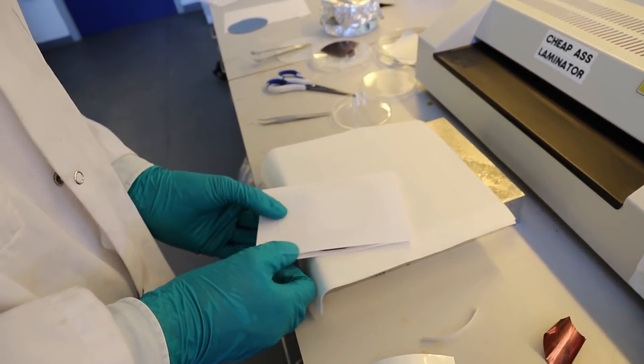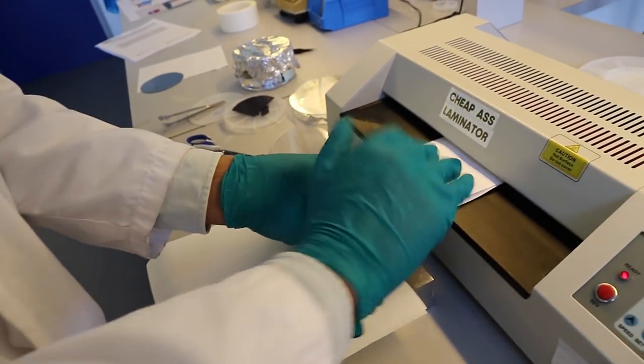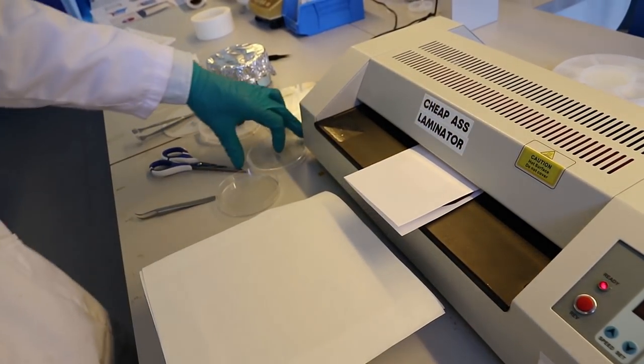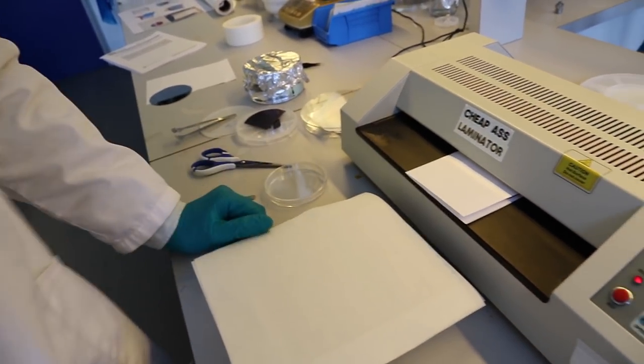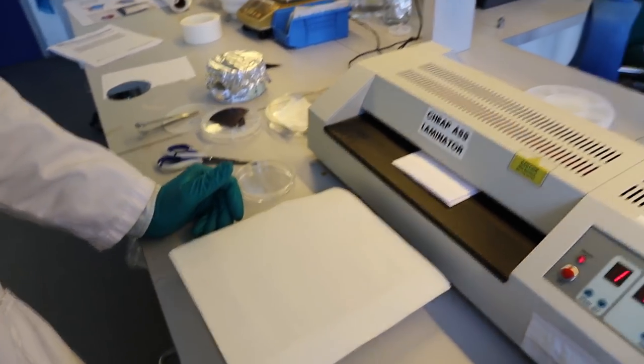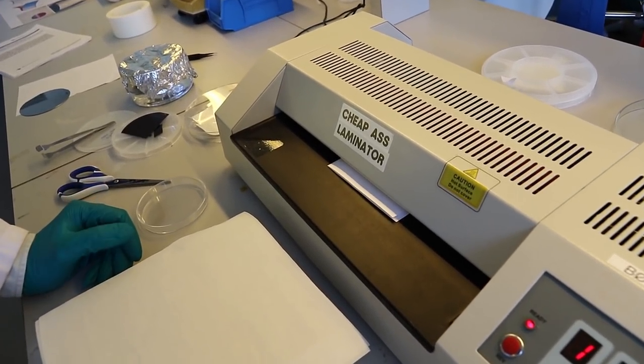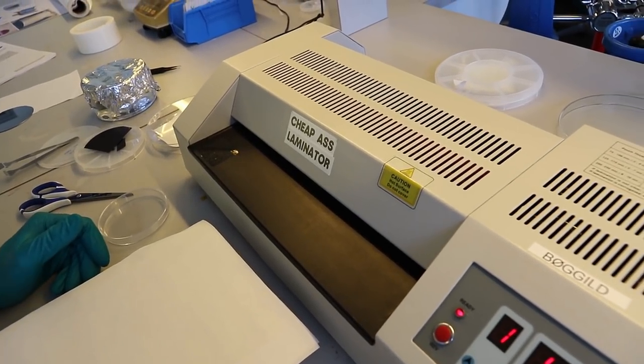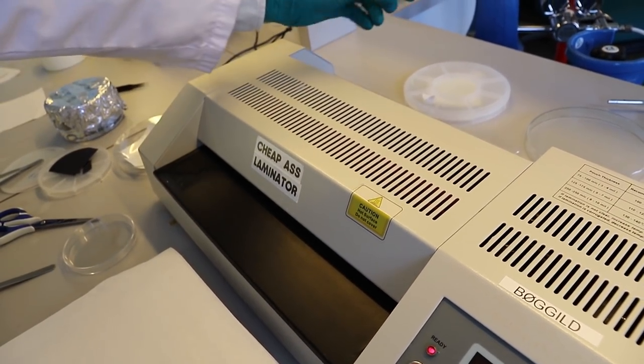We've tried it on glass, on sapphire, on a number of other polymers as well. You can try as long as they do not melt at such temperatures. So it doesn't matter what kind of paper you're using? A4 paper works best. Tissue paper can also work, but typically you want to avoid any sort of fiber-based tissue which would leave a lot of residues on the PVA foil. You can also use Teflon sheets.